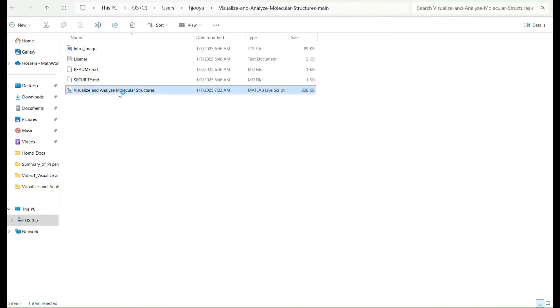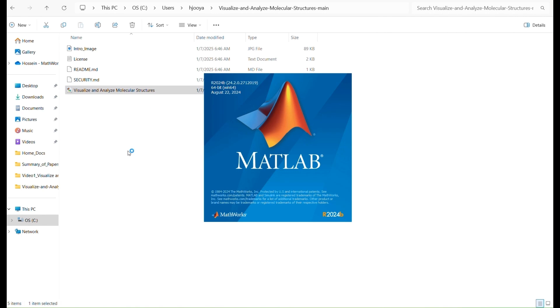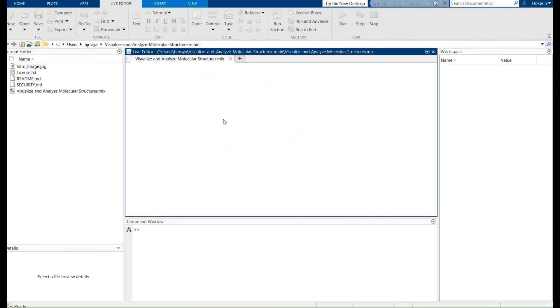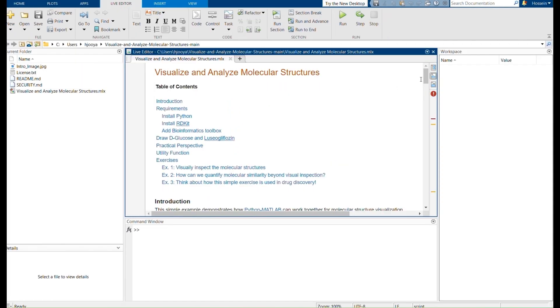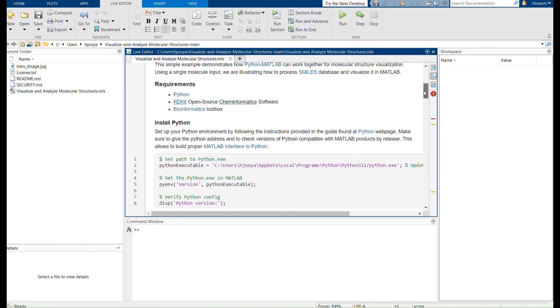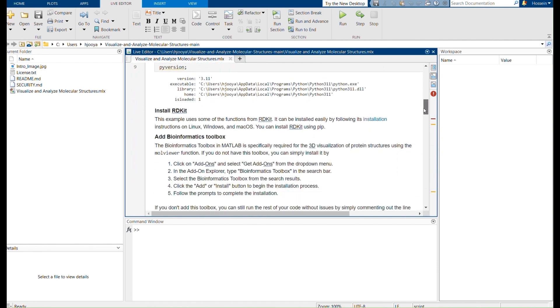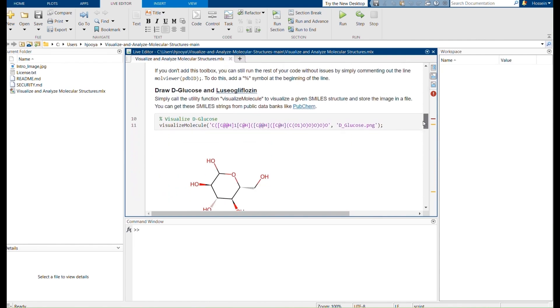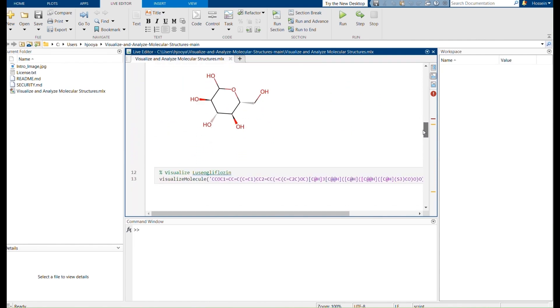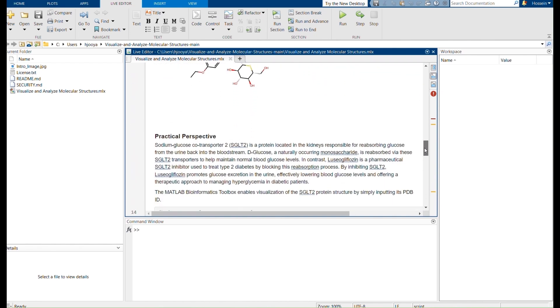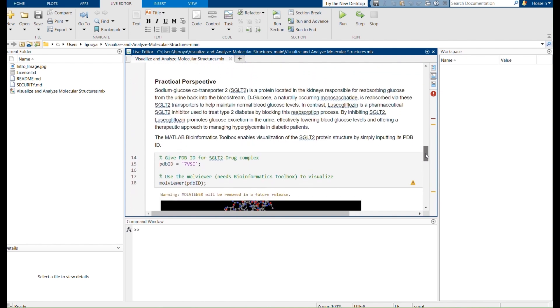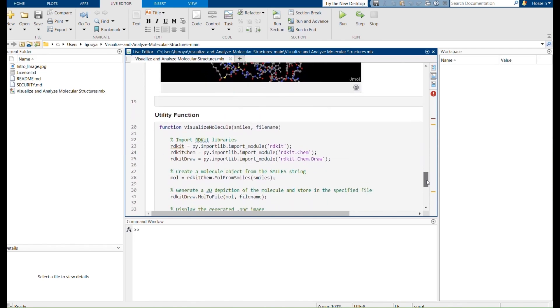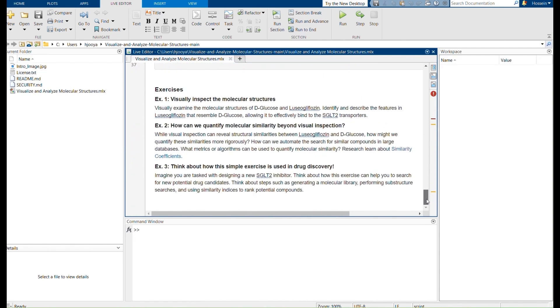The LiveScript begins with a list of requirements and installation instructions, as I just explained. The code then shows you how to visualize D-glucose and luciogliflozin, which is a sodium glucose co-transporter inhibitor. Explore the practical aspects of this example and try out the exercises provided at the end. Simply click the Run button to see it in action.